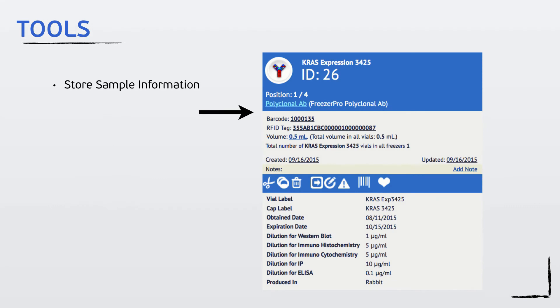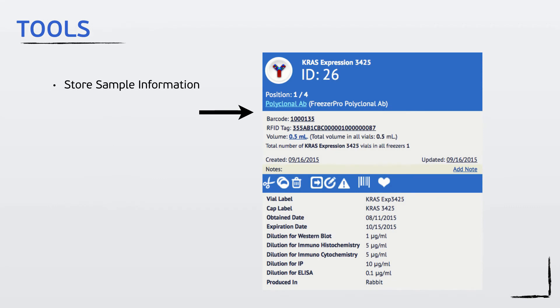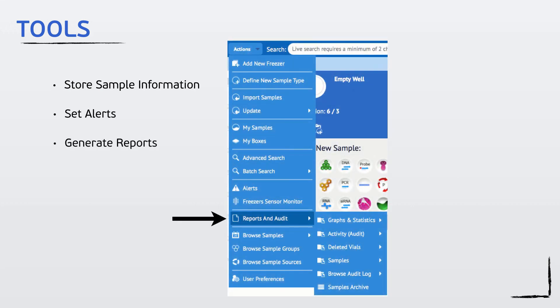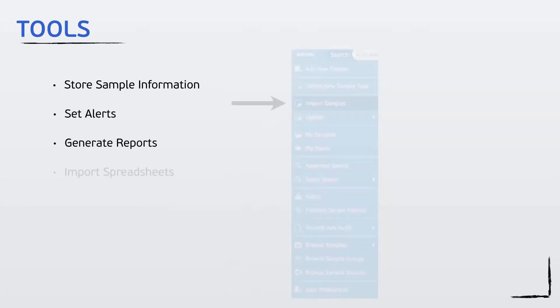It is easy to use with the ability to store all sample information, set alerts, generate reports, and import spreadsheets.